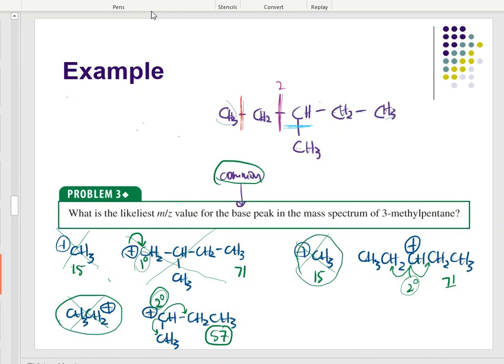Remember, I told you that in these cases, the molecule is going to prefer to break apart in the piece that it feels the most comfortable with. That it can really look at these pieces and say, I feel comfortable with you going out on your own. And the bigger the piece, the better. Well, in this scenario, if the molecule cleaves like it has, I get a 2-carbon piece and a 4-carbon piece.